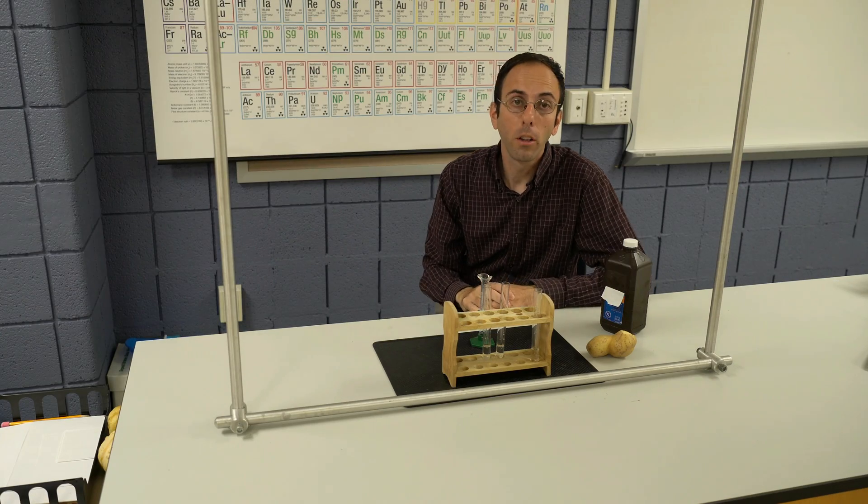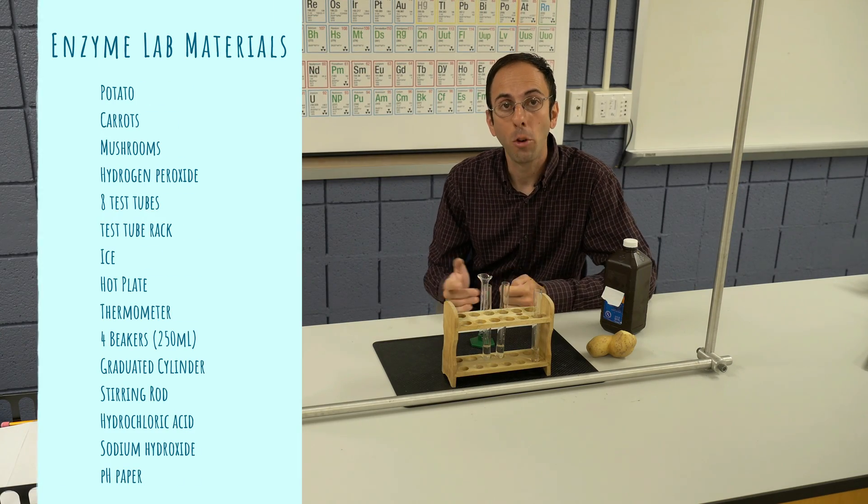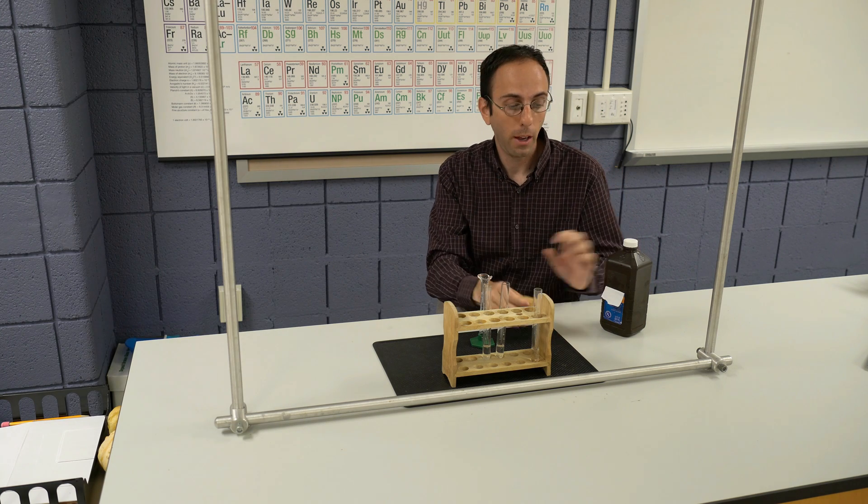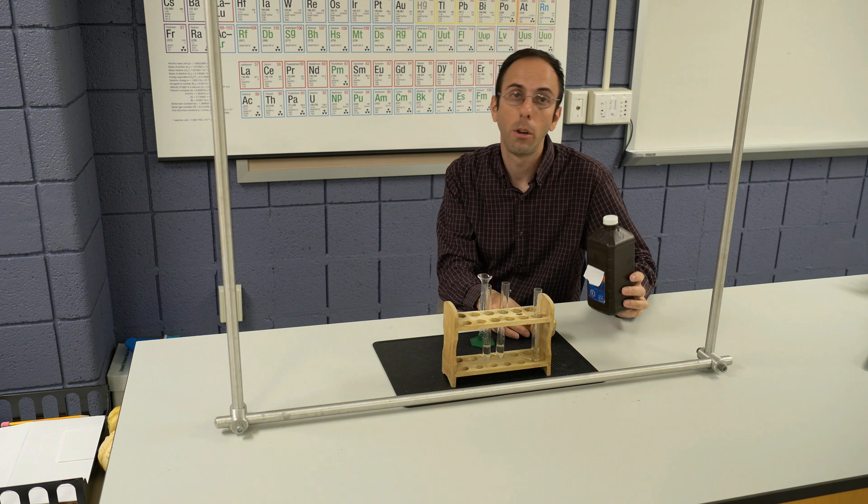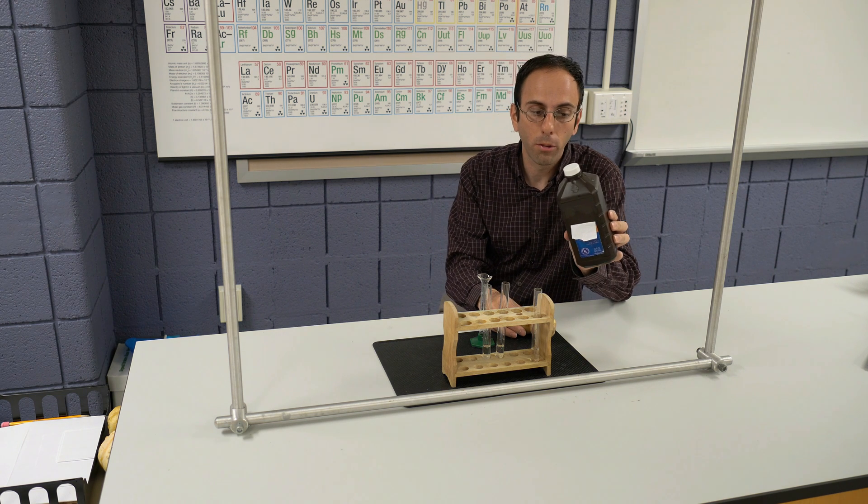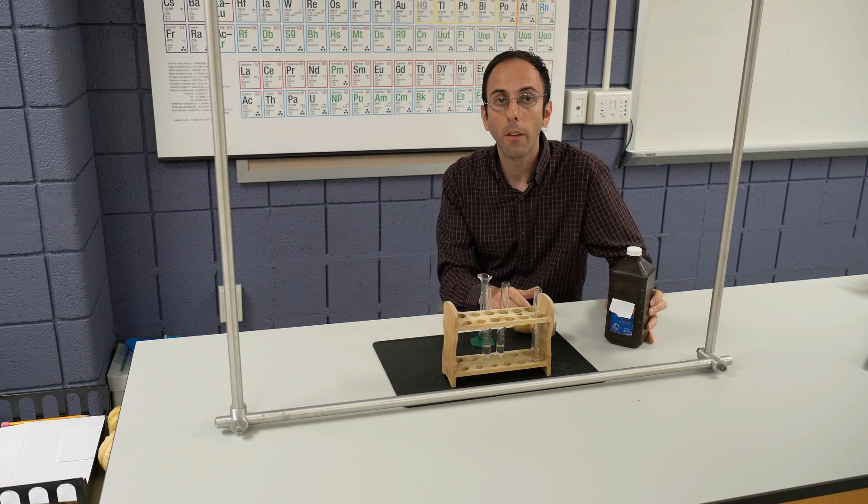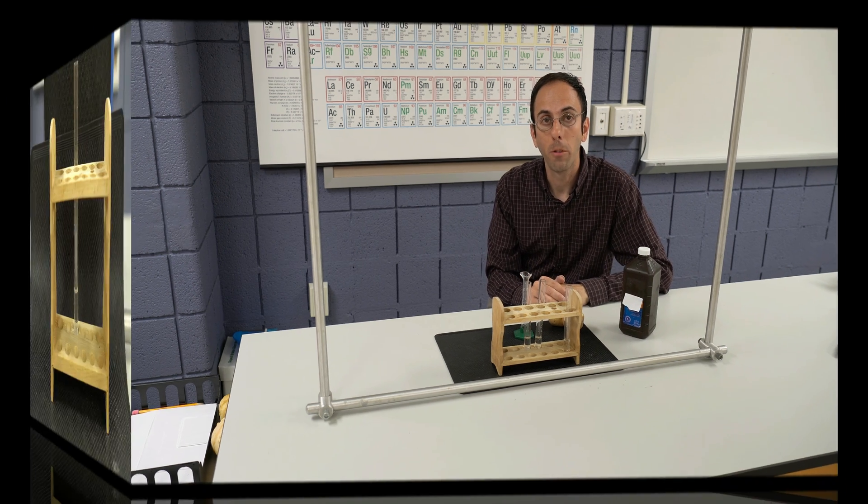Okay, so here we're going to be looking at a catalase enzyme normal reaction. We're looking at catalase contained in this potato and how it reacts to hydrogen peroxide. This is typical store-bought, about 3% hydrogen peroxide. We're going to see how this reacts and look at some observations.